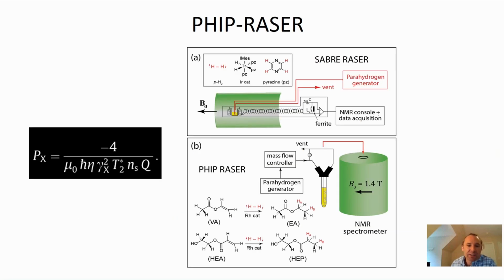And in this particular contribution, we did 2 types of experiments that we describe. One is SABRE with pyrazine, and this was chosen with a purpose. So pyrazine, if you look at the structure above, is only associated with one single line, one single frequency, because there's no chemical shifts present. And it gives us a very nice model system to study RASER effects.